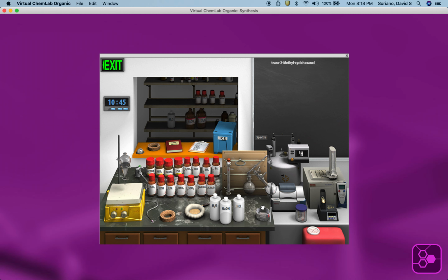If you don't get lighting up, then it's not a solid. Oh, wait a minute. Let's see. Nope. Now, of course, I would have my students look up the melting point of the product. That goes without saying. They would know and anticipate. No, that's a liquid in there.